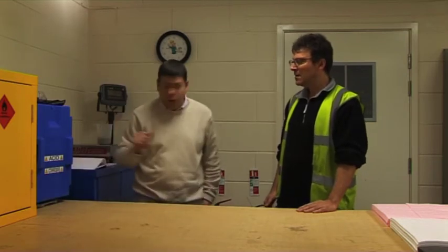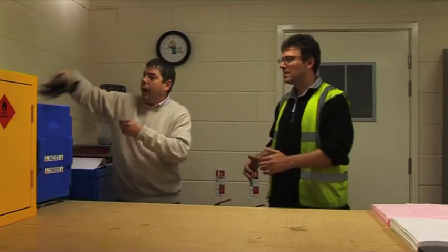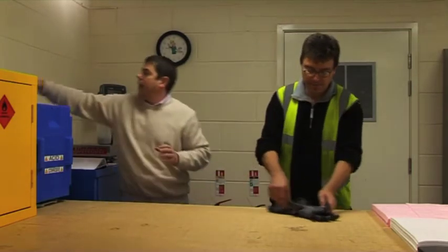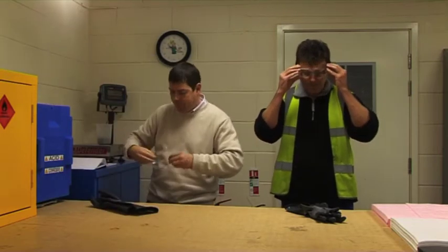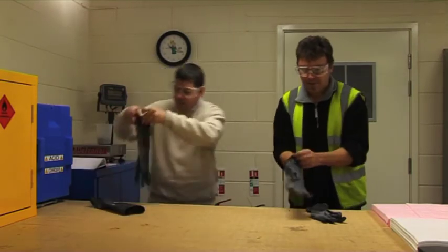Well, battery acid is basically sulfuric acid. I've got some in the cabinet here. Put this PPE on and we'll have a look and show you how it works. As John and Peter put on the appropriate PPE, the question on everyone's mind is: will it absorb?